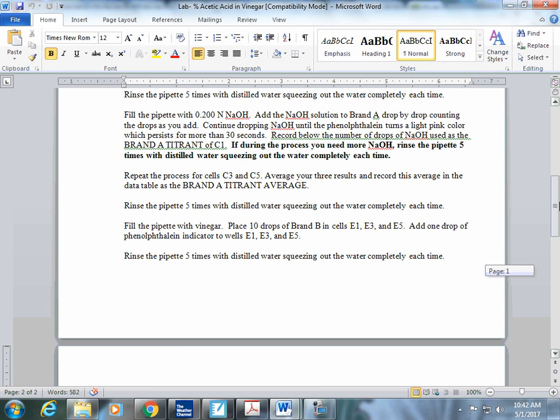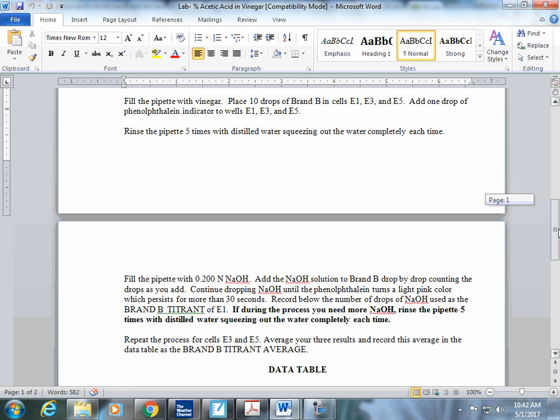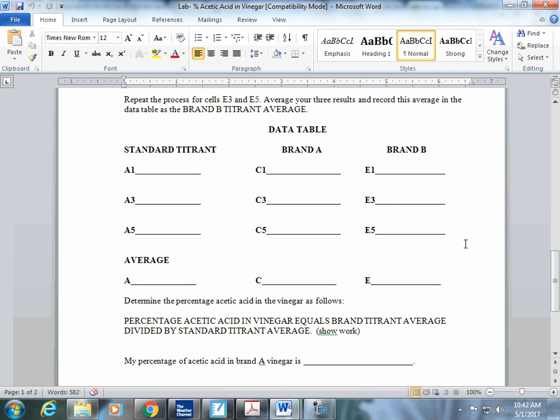You're going to follow the same exact procedure for brand B vinegar. So you'll get the brand B vinegar, you put 10 drops into E1, E3, E5, and you're going to come up with a brand B. And E down here would be the average of the 3 trials.